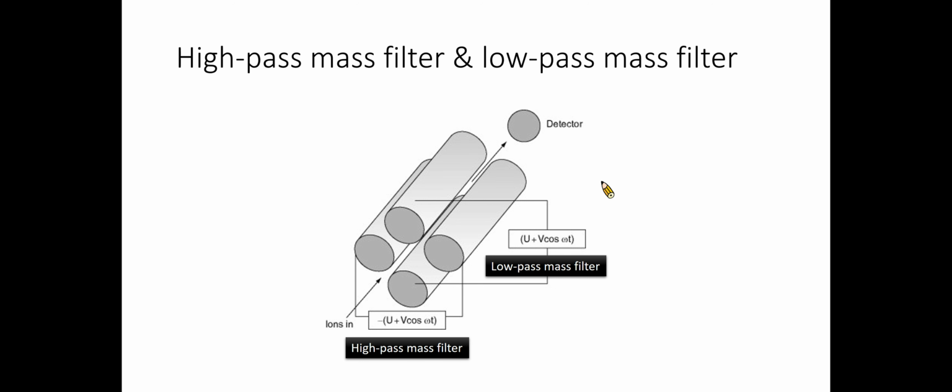Because of this short period of negative potential, only the lighter positively charged ions will be defocused by these rods. This also means that these rods will focus only on relatively large positively charged ions, so that they can be considered as high mass filters.